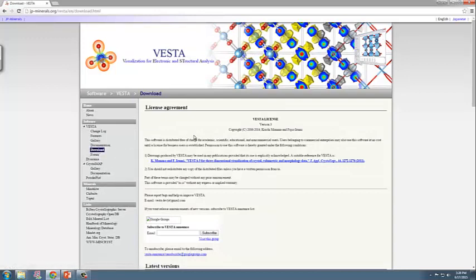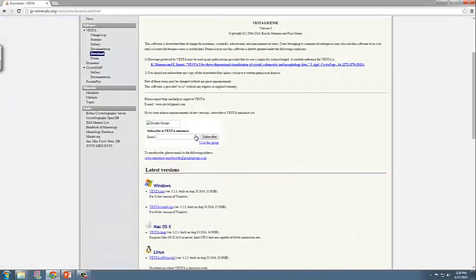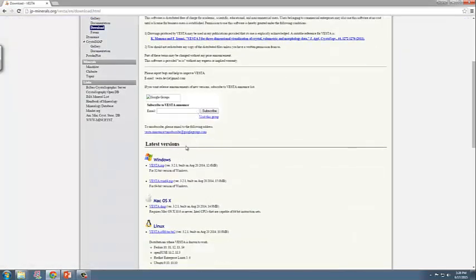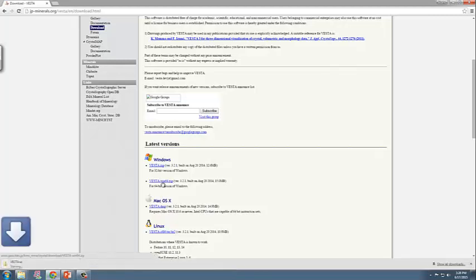Once here, you scroll down to the latest versions. They have different versions: Windows 32-bit, Windows 64-bit, and also a Mac OS version. What you need to do is just click on the Windows 64 file and then download it to your desktop.